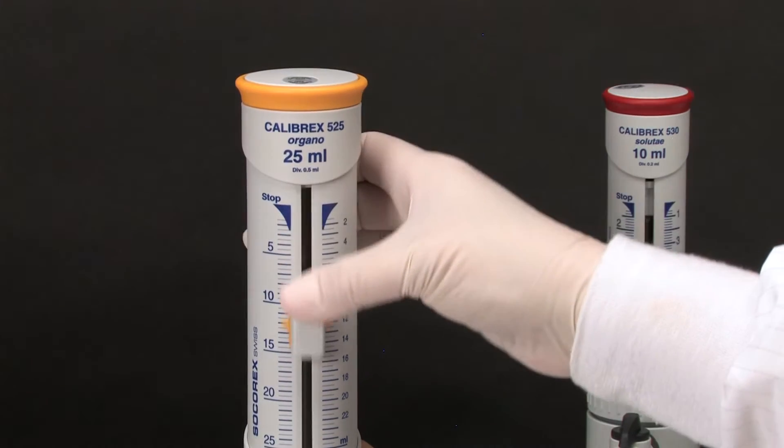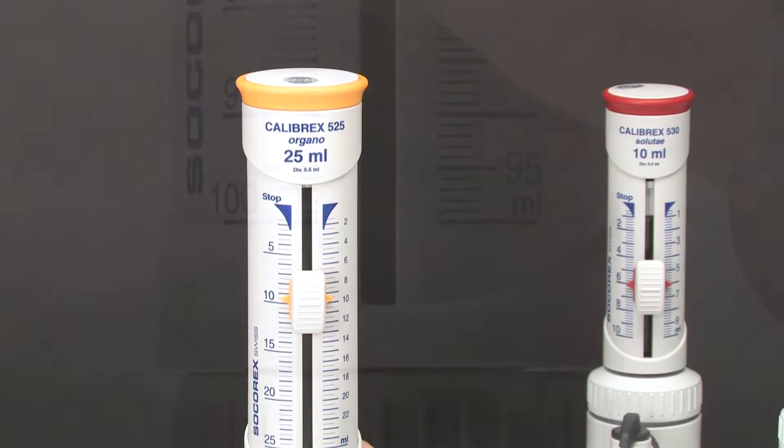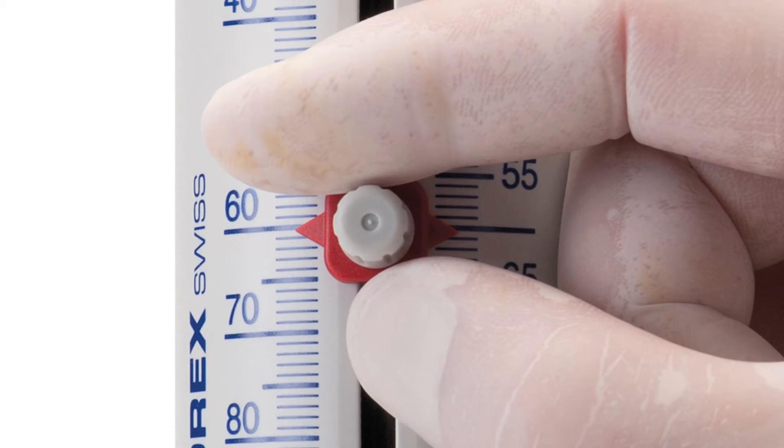The volume sliding cursor moves up and down very easily with one hand and precisely stops at the desired position. If required, an alternative screw type button is available as an accessory.